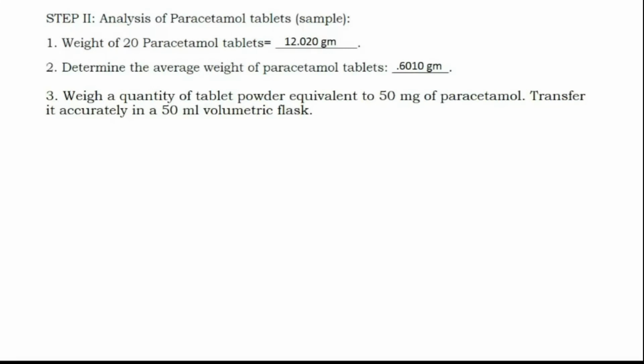We started with 10 milligram of the standard drug. But we are starting with 50 milligram of paracetamol in tablet powder. You understand this difference between the starting point of standard and starting point of the sample?